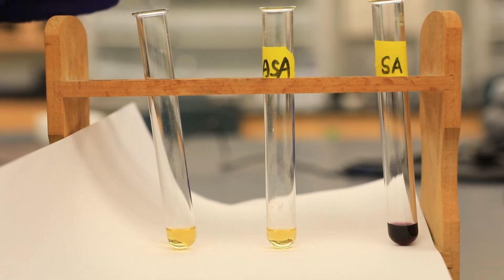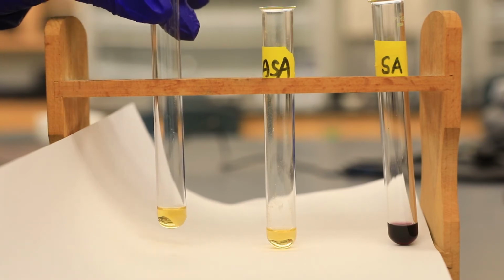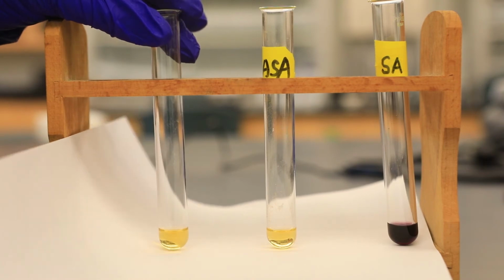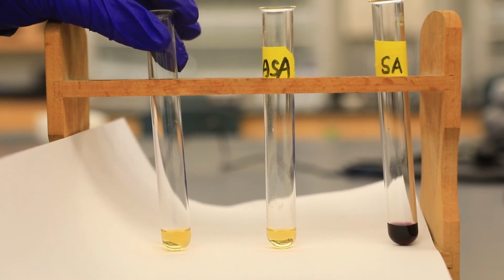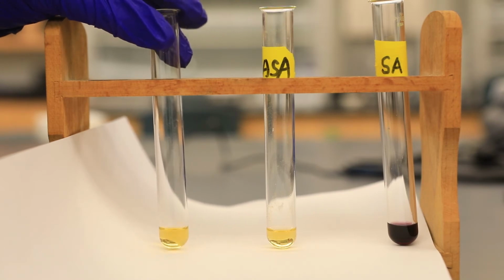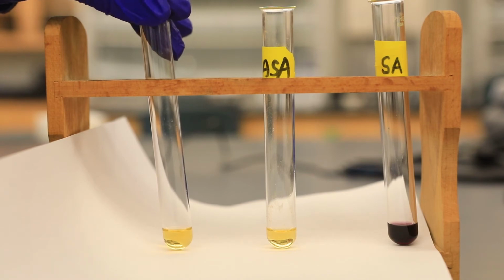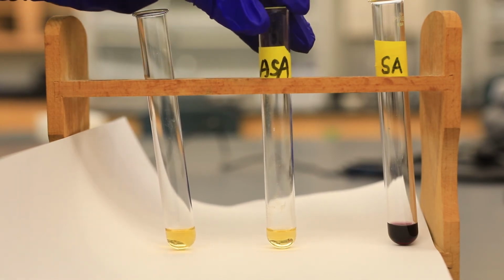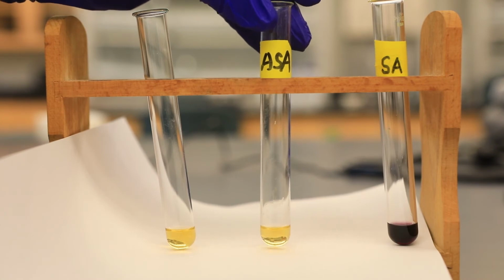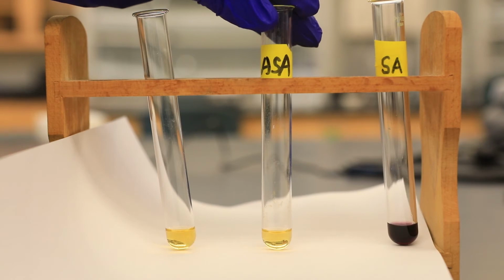And so what I have here are 3 test tubes. The first is our control. This is just ethanol in the presence of that iron chloride solution. Remember, it is iron that is required for the formation of that deep colored complex. So that's my control. And the second test tube, right now, is just my control. In a few seconds, I'm going to be adding aspirin to that.